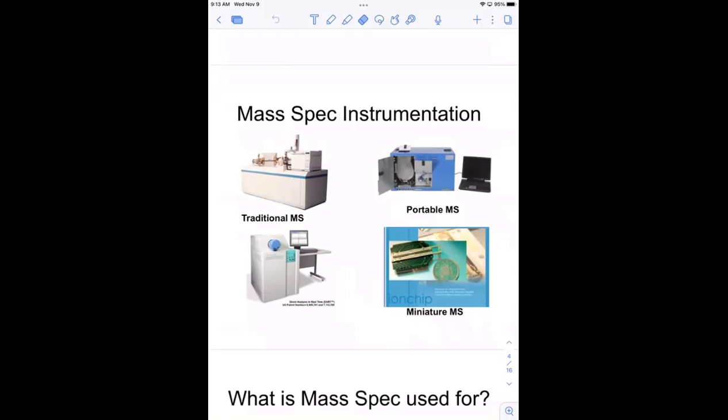And again, if they know what they're looking for, whether anthrax, or mustard gas, or some other type of chemical weapon, that chemical is going to have a specific molecular weight that can be detected by a mass spectrometer. So that's what mass spec is used for, to tell us about size and molecular weight, right?